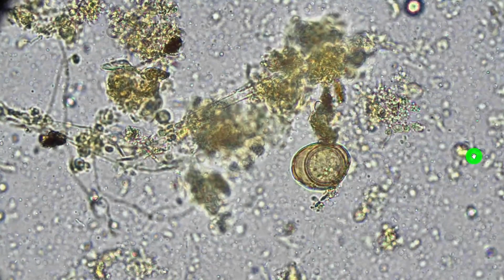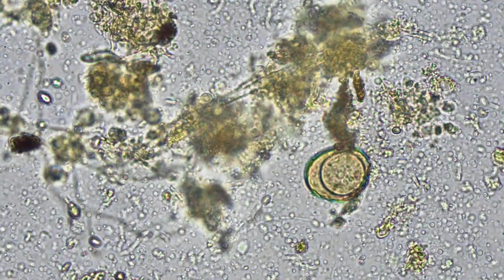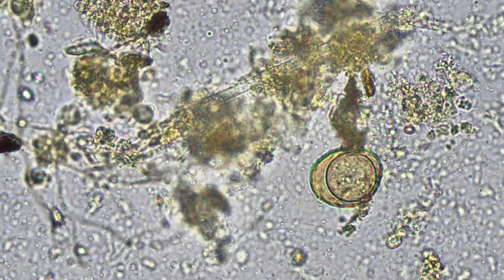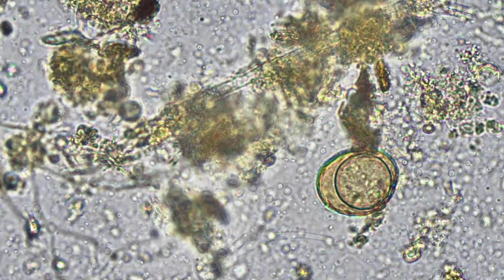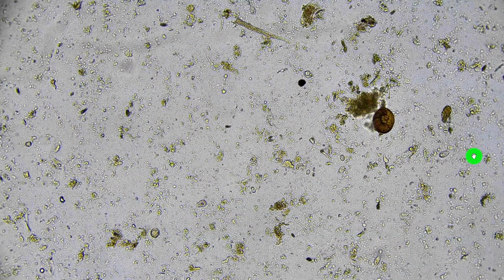What is this, right? Look at that. All right, then I'm going to say, okay, does it light up under epi? Something's going on there, and that look there to me is an indication that that's an egg of some sort. It is alive. You can see it moving. So yeah, I don't know what kind of egg that is, but there's a mass inside of that that's actually moving. So the epi is not lying at this point. That's why whenever I light something up that looks like that, eggs get this ring around it.